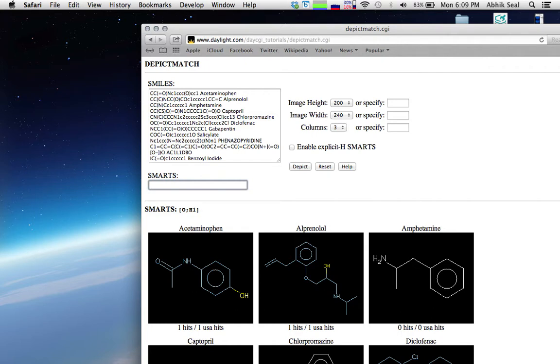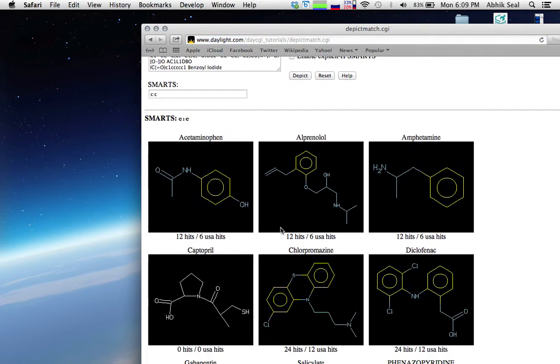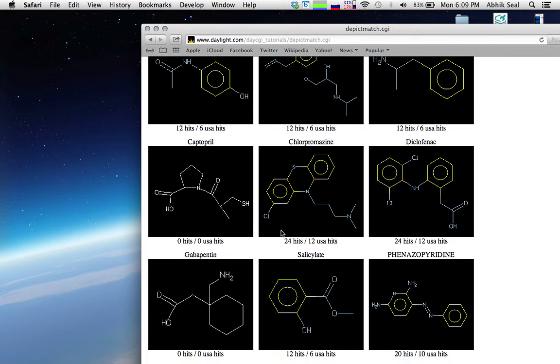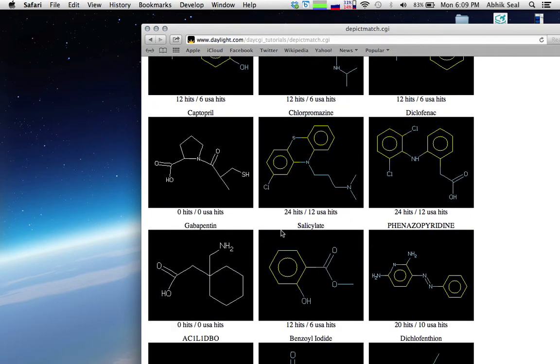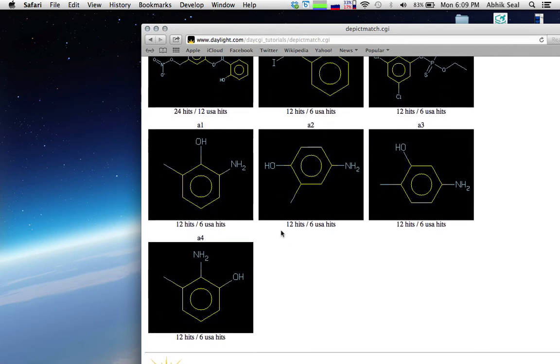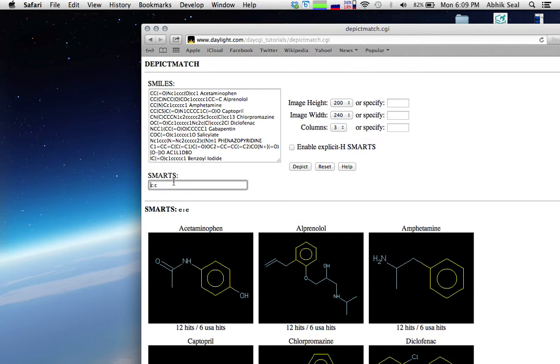Let's select this one. This SMARTS indicates two carbons separated by an aromatic bond. You can see it selected only those carbon atoms which are separated by an aromatic bond — so all the aromatic compound rings are captured.